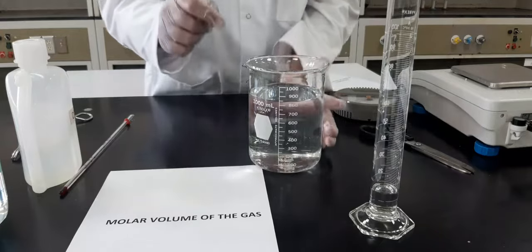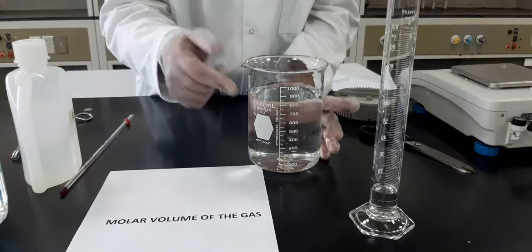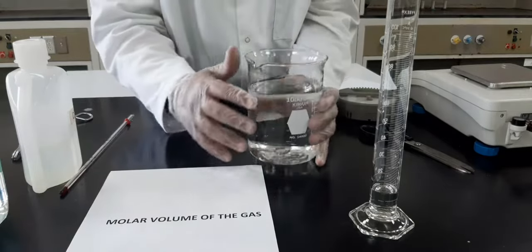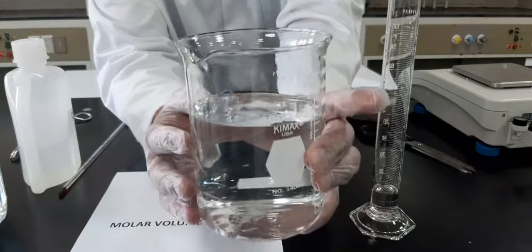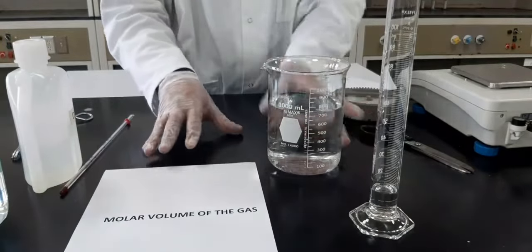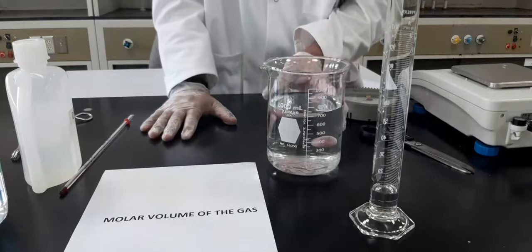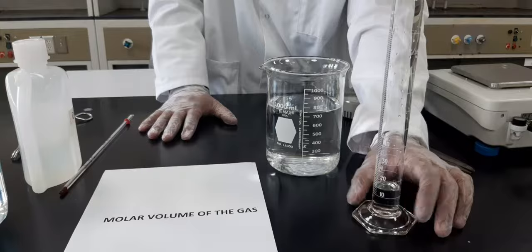Okay, so if you feel that the water is exceeding the limit of 700 or 800, you can drop some water into the sink. Now it seems to be closer to 700, so it's fine, we can use it. Now we have 15 ml hydrochloric acid in our cylinder.